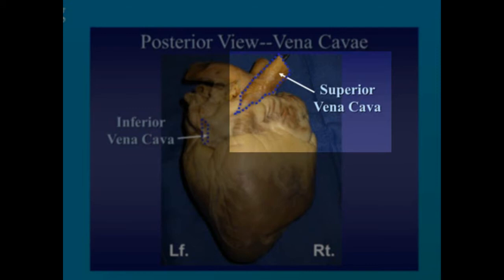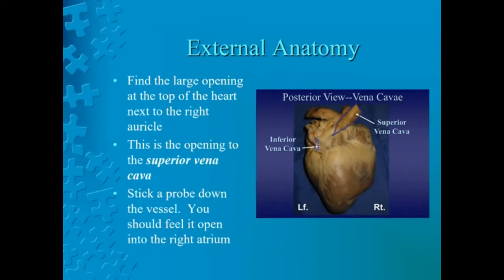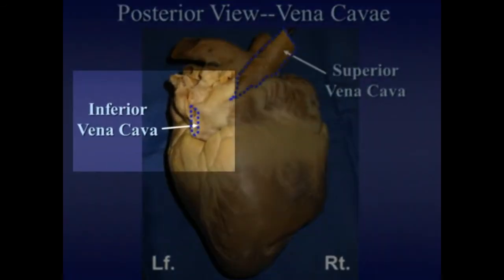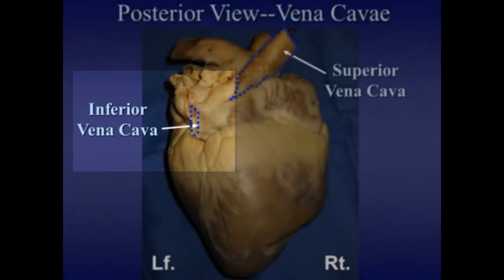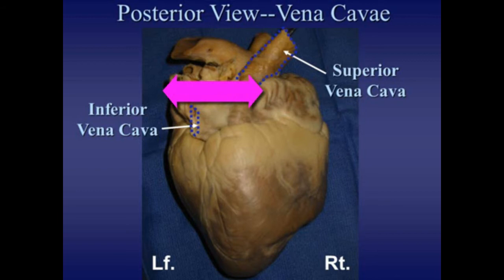The inferior vena cava brings blood to the heart from the lower part of the body. It is a little down and to the left of the superior vena cava. You will insert your thumb into this vessel and your index finger into the superior vena cava. You will be certain that you have entered the inferior vena cava as your thumb and finger will be able to touch. Your thumb should lead into the right atrium along with your index finger. Pause at this time to locate the inferior vena cava.